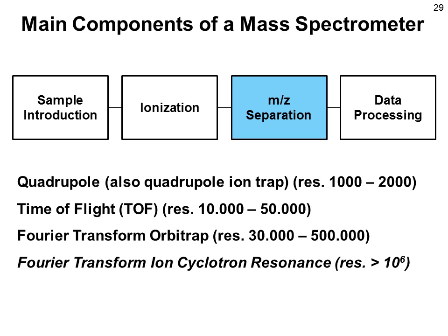The last mass analyzer is the Fourier transform ion cyclotron resonance mass analyzer. We will not deal with that in great detail as it is barely used in bioanalysis. This mass analyzer, which was developed already more than 30 years ago, can reach resolutions of more than 1 million and is thus the highest resolution mass analyzer. However, it requires a superconducting magnet which has to be cooled with liquid helium. This already shows to you that this is far from a routine mass analyzer.